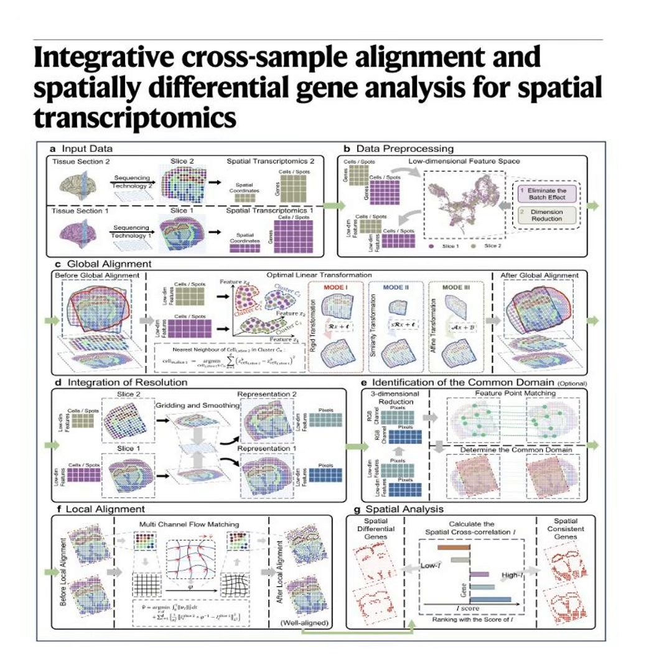CODA performs that rubber sheet stretch in the background, but before it applies it, it mathematically checks its work. It calculates whether this local stretchy alignment actually improved something called nearest neighbor label consistency. Meaning, did cells of the same type actually end up next to each other where they belong? Exactly. If the warp was accurate, similar biological structures should align. CODA requires a specific mathematical improvement threshold, represented by the Greek letter tau, set at 0.02.